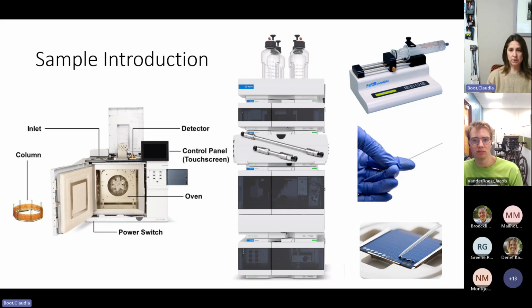This is really useful in terms of samples that have really low sensitivity for mass spectrometry. You can infuse a sample over a long period of time to average enough spectra to see a signal. This is something that happens with some gold nanoclusters that we've worked on with the Ackerson group, that we have to introduce this way.